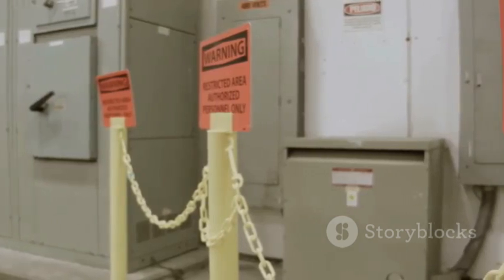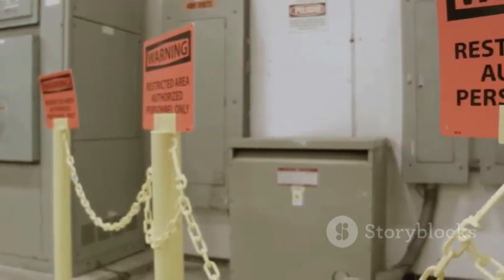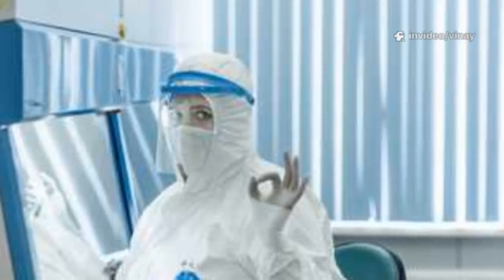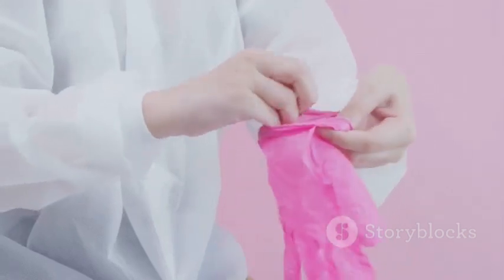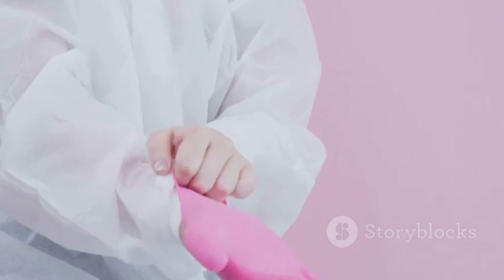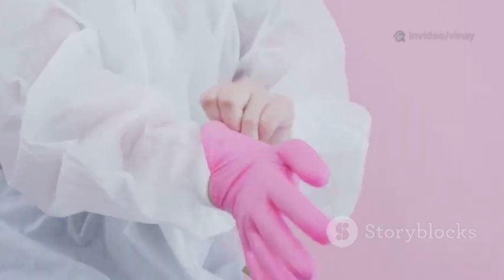Furthermore, practices that are normal elsewhere are strictly forbidden. Talking should be minimized, as it generates aerosols. Touching any part of the face or adjusting goggles is prohibited. If an operator's sterile glove touches a non-sterile surface, it must be immediately changed or sanitized using a validated procedure.